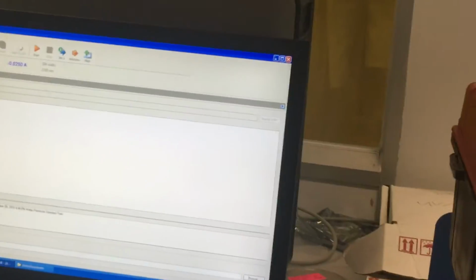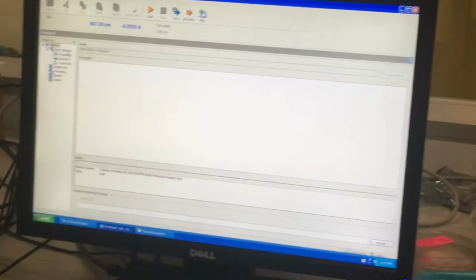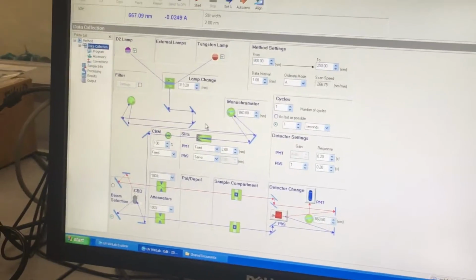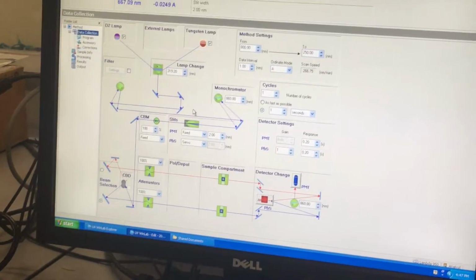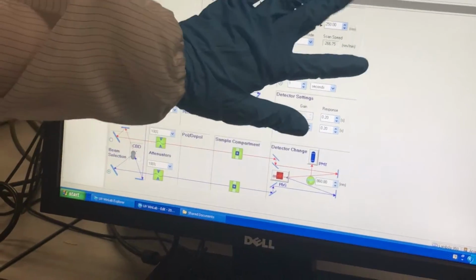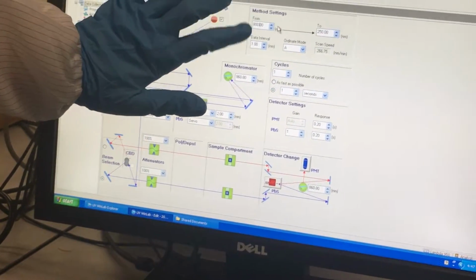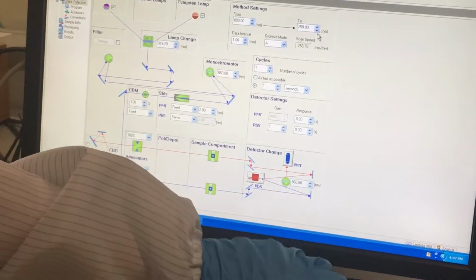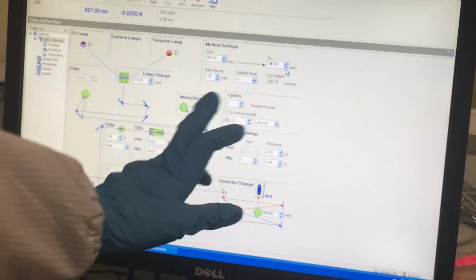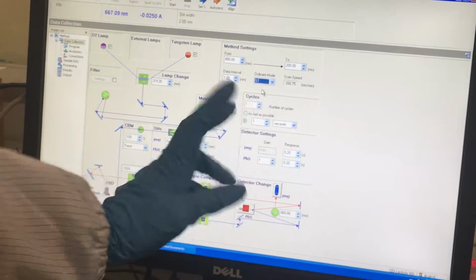Even you are normal. Alright, starting, we are going to measure the transmittance of the sample. Okay, normally we are going to set, listen carefully, later I will ask you to do this. We are in the data collection, we are going to set only this setting from 800 to 200, and then we go for transmittance.